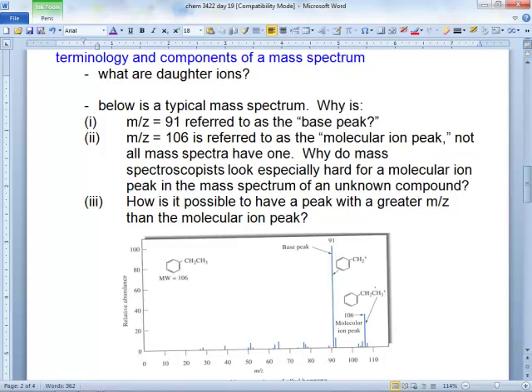I think intensity is just easier to remember. Okay. And I think the concept is nice because it's really kind of preparing it for the library search. Because no matter what mass spec you shoot this compound on, the relative abundances are going to be the same.